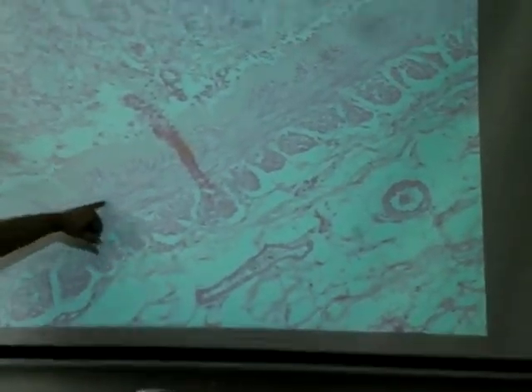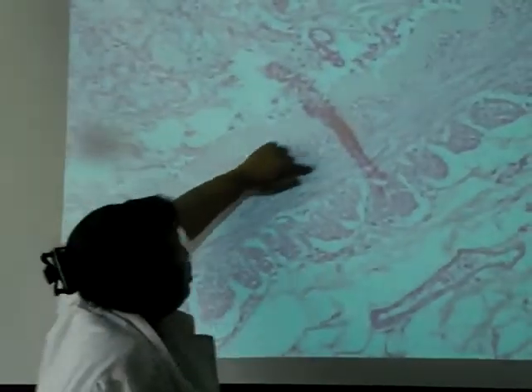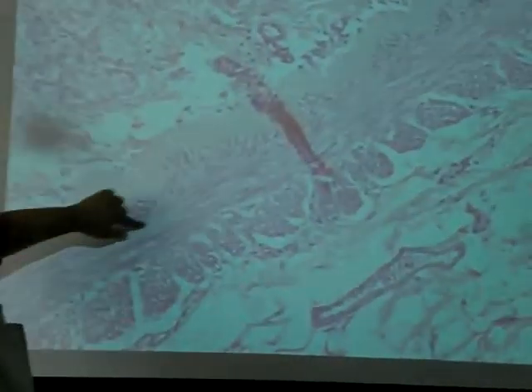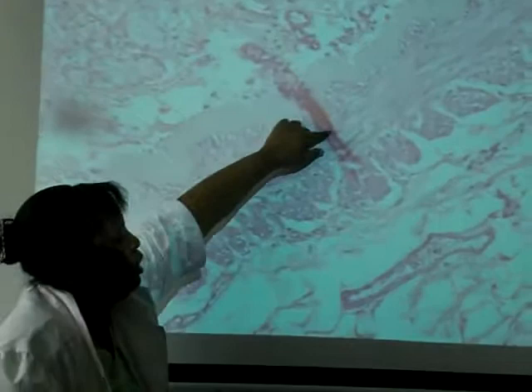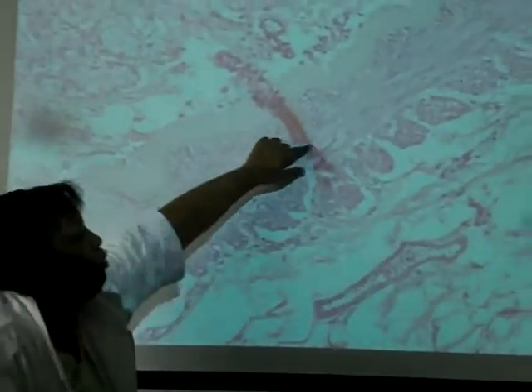All right, here's our muscle layer right here. This is still submucosa way up here from before. This is actually the bottom of it. Here is the muscularis, which would be the third layer below the submucosa. And again, it's going to be smooth muscle. It's not skeletal in your organs. It's going to be smooth muscle tissue forming this.